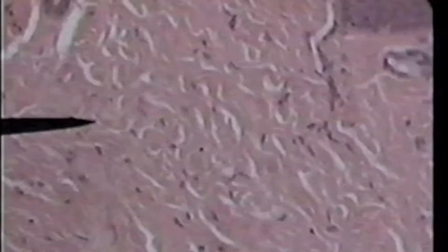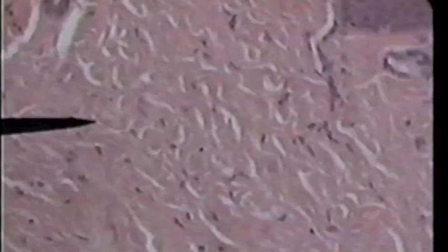Dense irregular connective tissue on high power, found deep to the epithelium of the skin. We are looking at this area and we can see little black dots. Those little black dots are the nuclei of the fibroblasts. In between them are many collagen fibers staining pink, but laid down in a very irregular pattern.